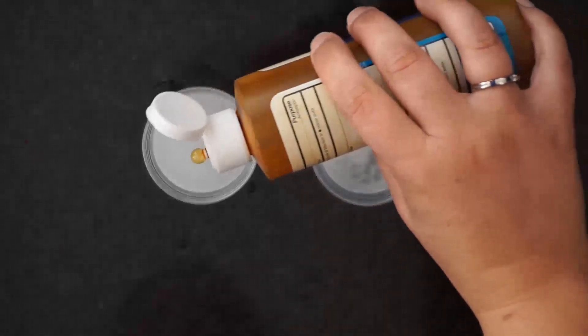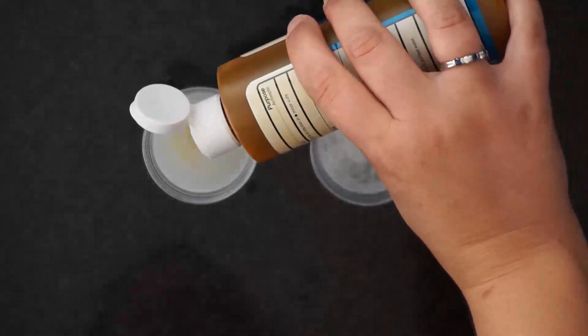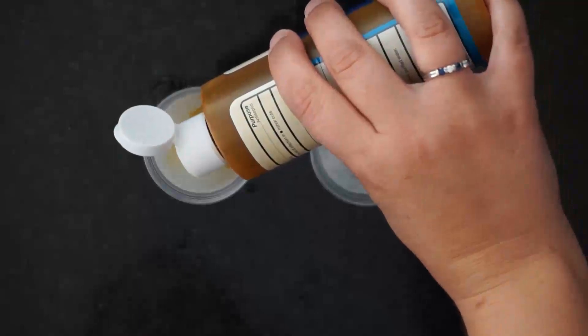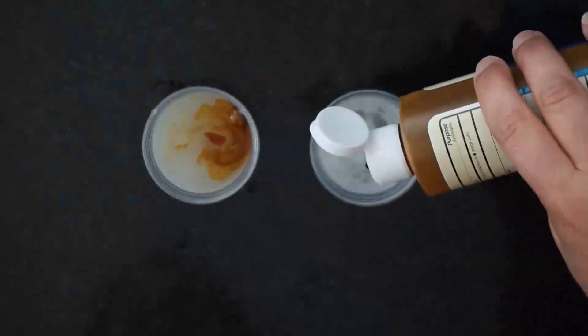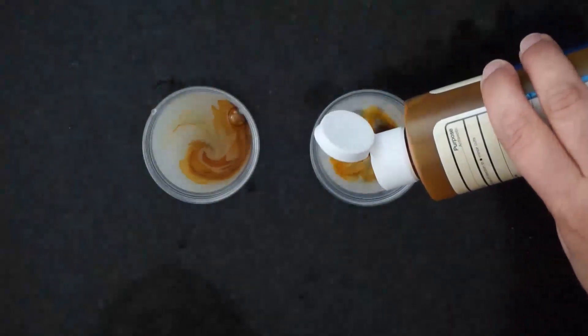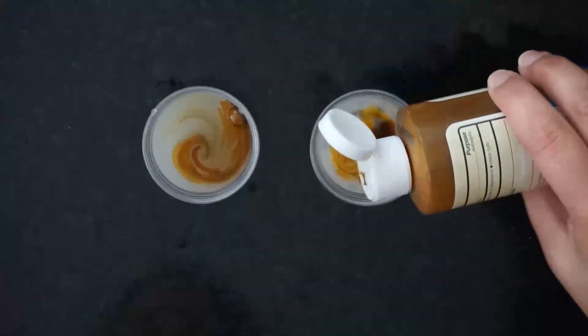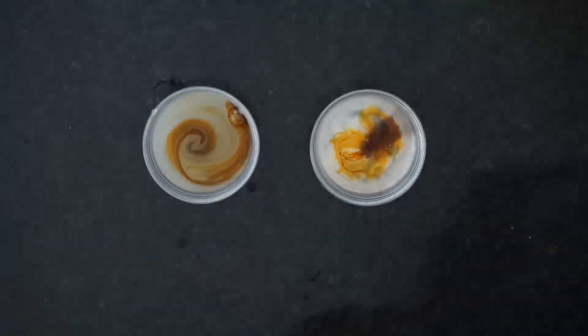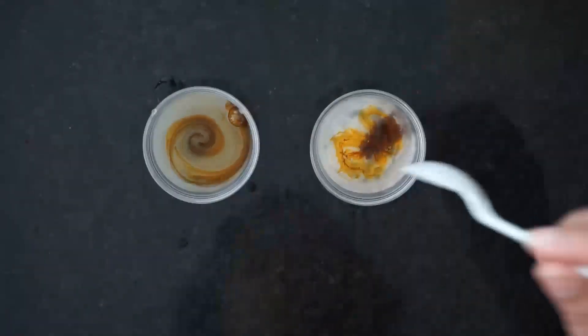After 30 minutes, drip five drops of iodine into each of the cups. Then you're going to stir both cups.